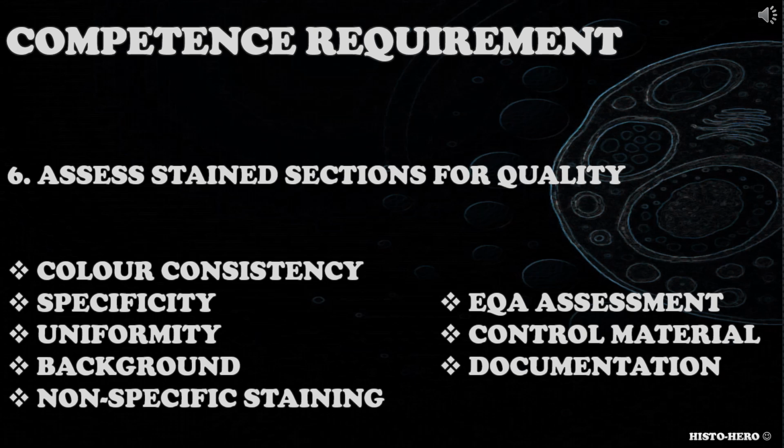The sixth competence requirement is for you to assess stained sections for quality. How would you assess quality of sections stained with relevant demonstration methods? What steps would you take? How are those slides assessed during EQA assessment? How do you maintain appropriate audit trail record?